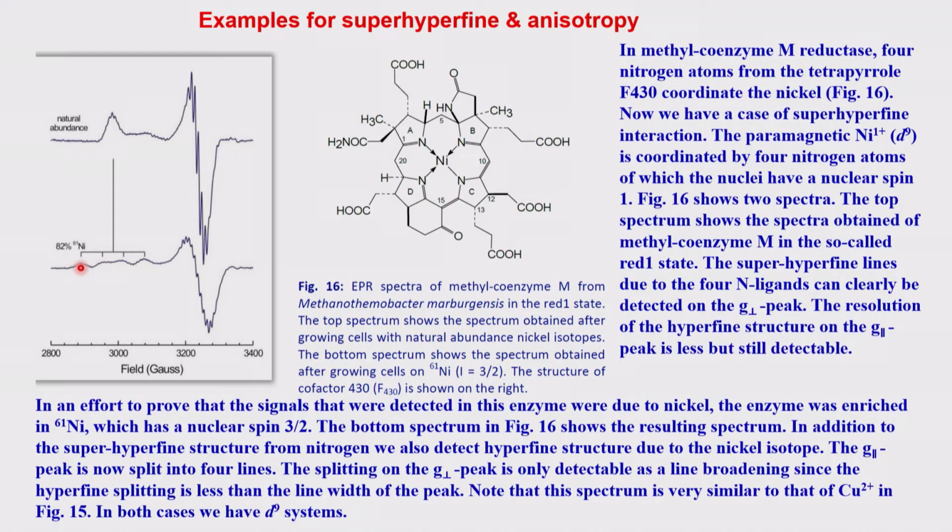So each one of the small ones will have 9 lines here, 9 lines here, 9 lines, but they will overlap. But their further isotropic coupling value will be so small, you will not see each one of them separate. Now here, if you look at here, you can see those things as well. But here already 2 of them are overlaid, because this is coming from the 2 axes and this is coming from only 1 axis, plus the nitrogen coupling. So that's where you can see that.